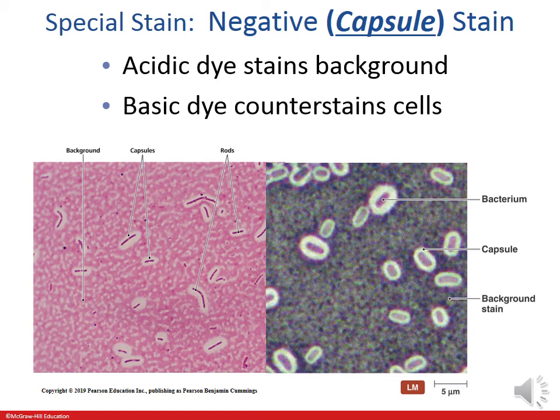So there's no distortion. The morphology and arrangement are really easy to see on these, and the thickness of that capsule can also be estimated. That's sometimes the way we distinguish between different bacteria, just how thick the capsule is. If there's a capsule present, you may hear it referred to as capsular or encapsulated. All of those mean that a capsule was detected, basically.